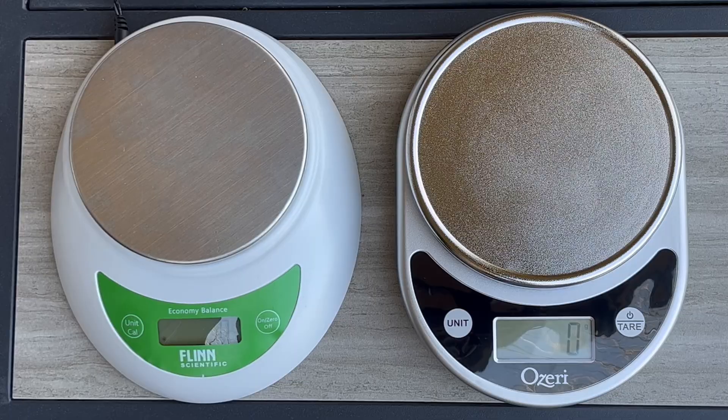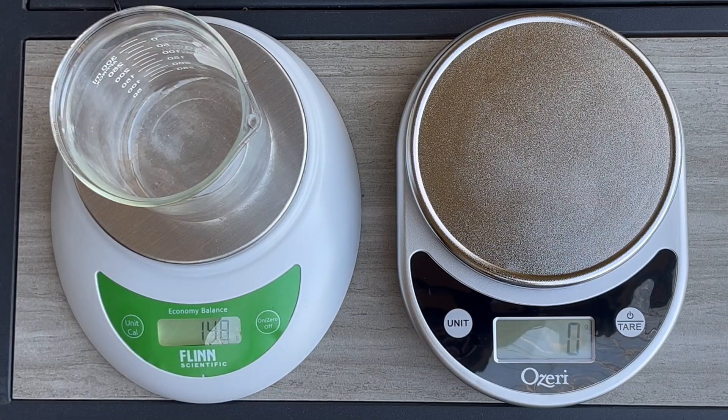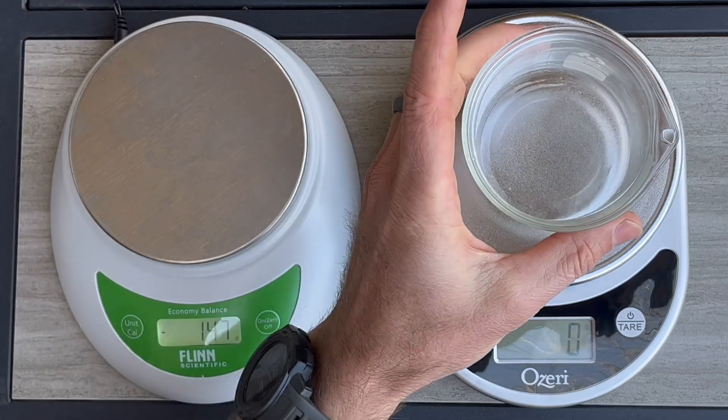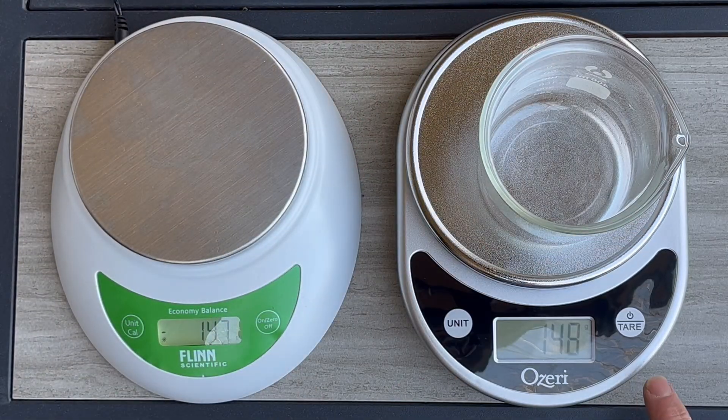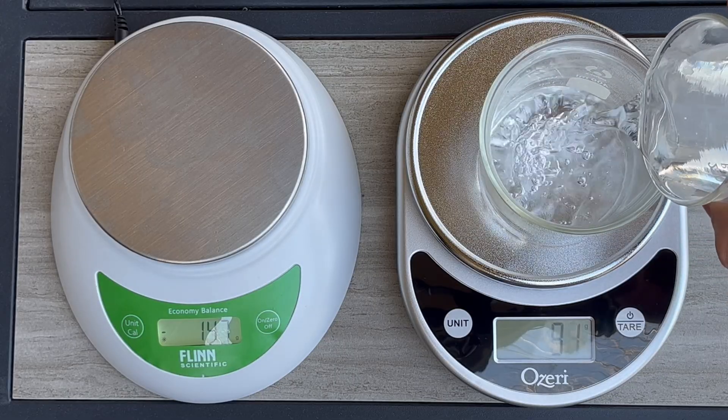Both of these digital scales have a cool feature that will save you from having to do this extra math. On the Flinn Scientific digital scale, if you put a container on it and hit the zero button, it essentially removes the weight or mass of the container. On the Ozeri version, you hit the tare button, which does the same thing — it removes the mass of whatever is currently on the scale, so when you add your liquid you only get the mass of the liquid itself.